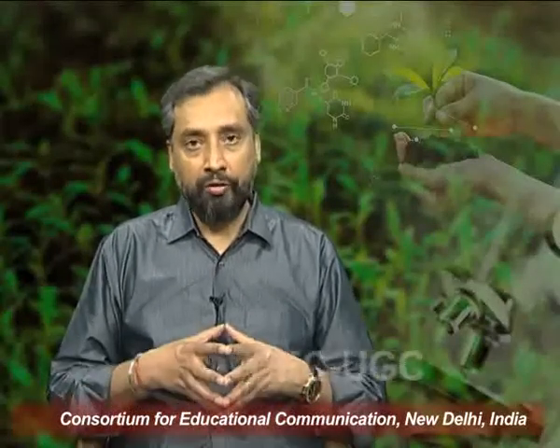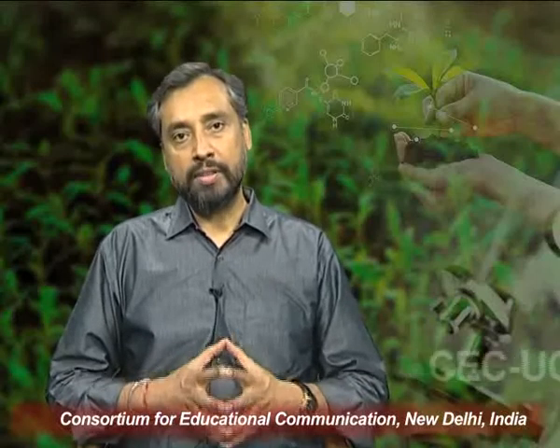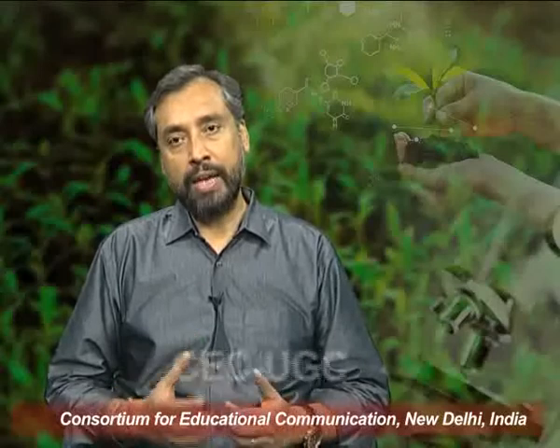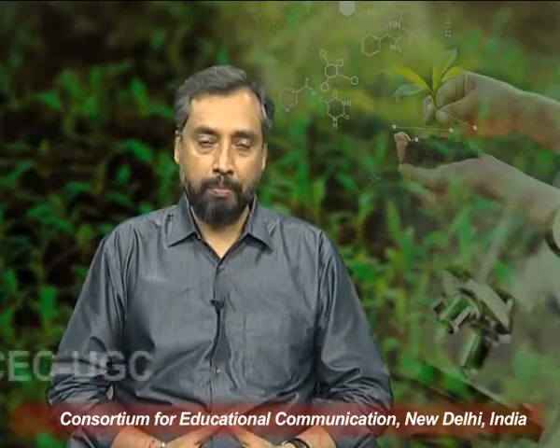So now let us talk about some of the variations of scanning electron microscope. One of the foremost variations, or modifications, of scanning electron microscope is scanning transmission electron microscope, also called STEM in short form. So what happens in STEM?